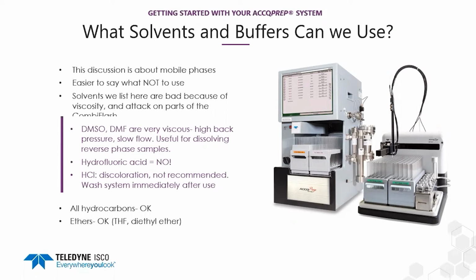Using inorganic buffers such as phosphate buffers or citrates, you can run the system with it. They will wear out the pump seals a little bit faster, but they do not otherwise harm the system.